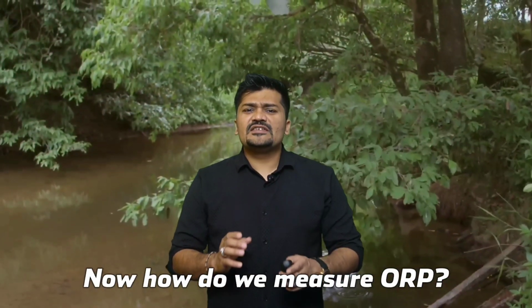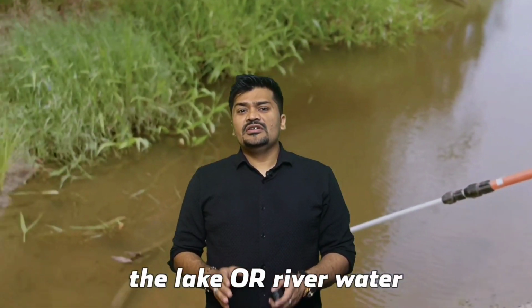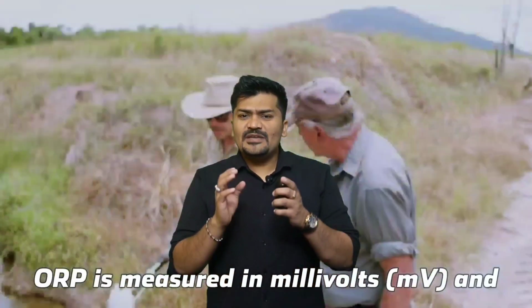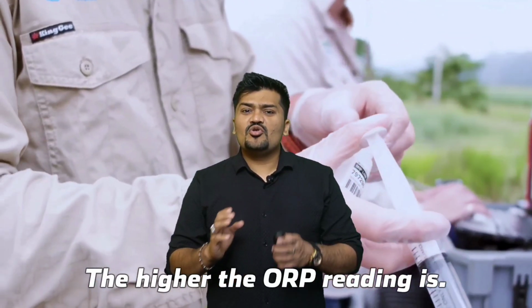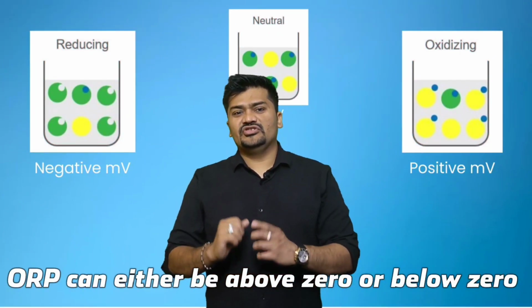Now, how do we measure ORP? ORP is measured directly in the lake or river water that you are investigating using an ORP sensor. ORP is measured in millivolts, and the more oxygen that is present in the water, the higher the ORP reading is. ORP can either be above 0 or below 0.